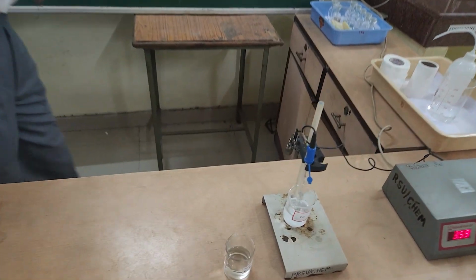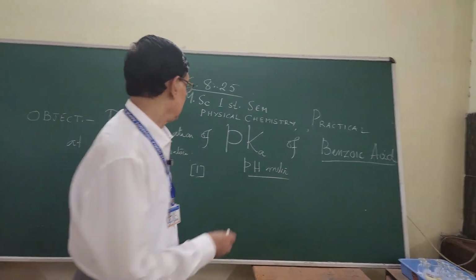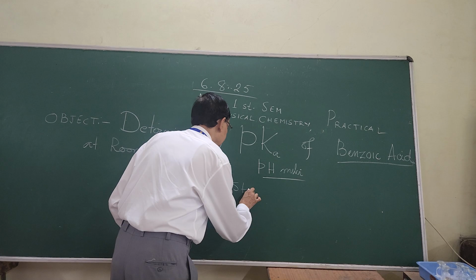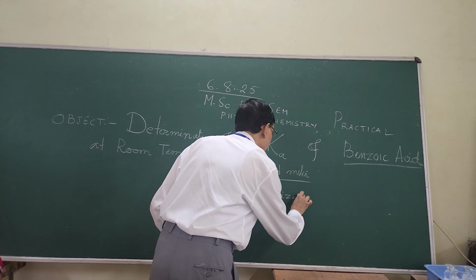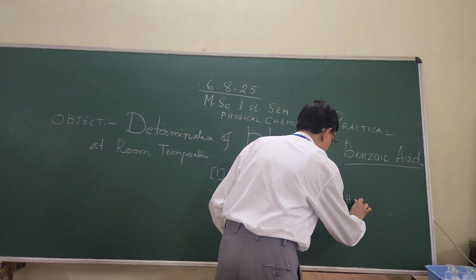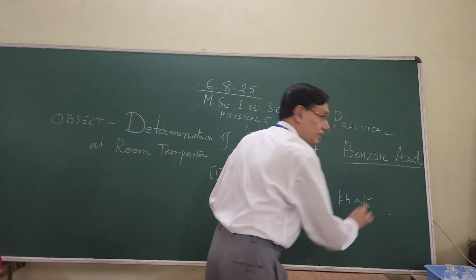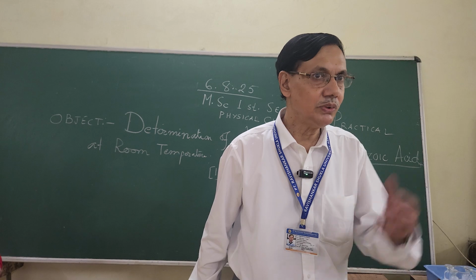Okay. So the first part is the standardization of the pH meter. Standardization of the pH meter. For that, what do we need?